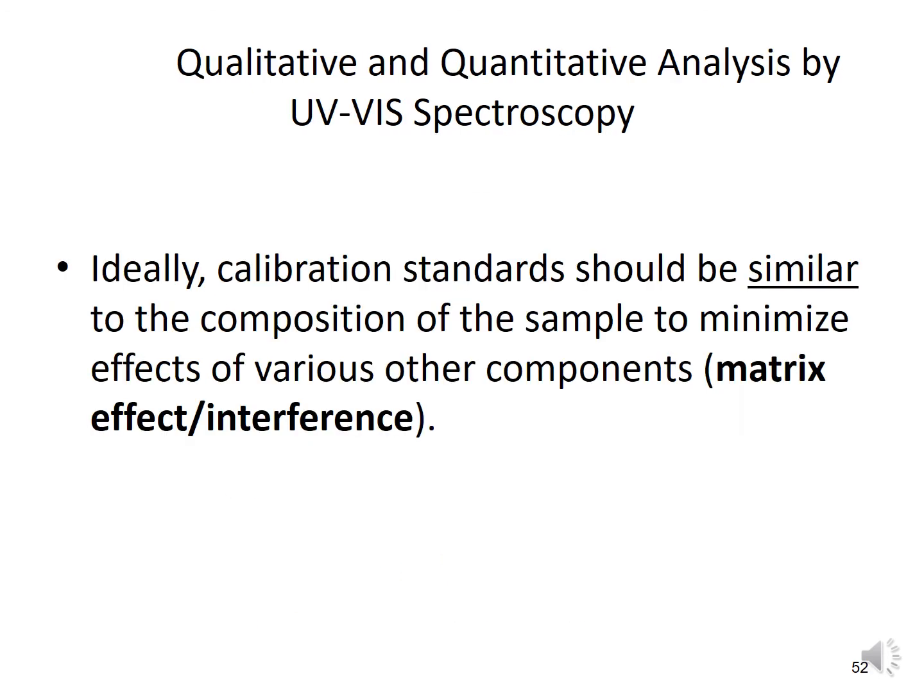So ideally, calibration standards should be similar to the composition of the sample with various other components. So this is what we call a matrix effect or interference. So we try very hard to remove the interference. Okay.